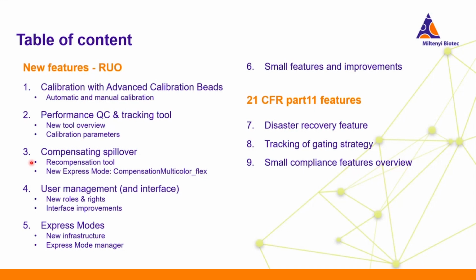One is a tool which can be used for recompensation of already acquired single stains. And there is also a new express mode, which is called compensation multicolor flex. And I will show you how to use both. So this is something every user might come in contact with.